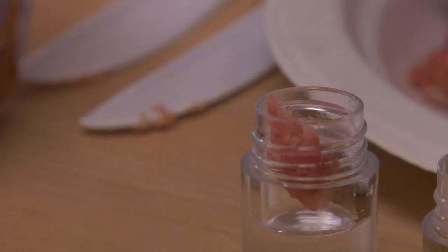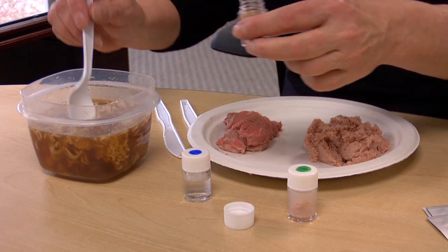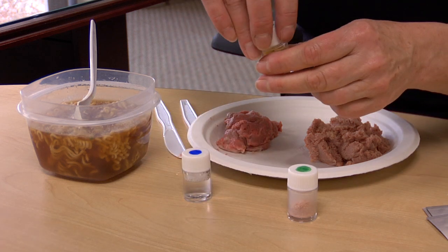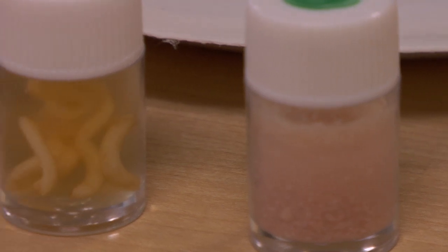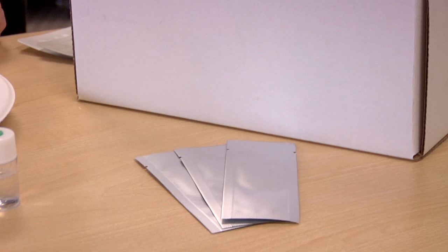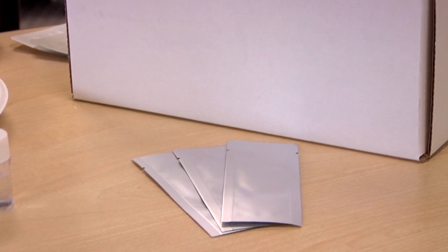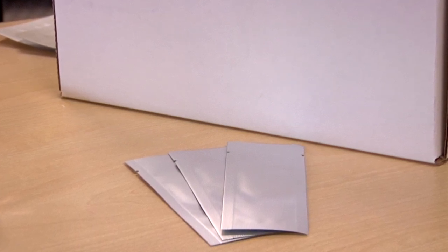If the meat is not homogeneous or cut into small enough pieces, it may be harder to ensure any pork present can be accessed by the extraction solution and detected. We might consider crushing the sample or mixing it to be sure it is homogeneous. The test strip is removed from the package just prior to use so moisture does not come in contact with it, potentially reducing the sensitivity.